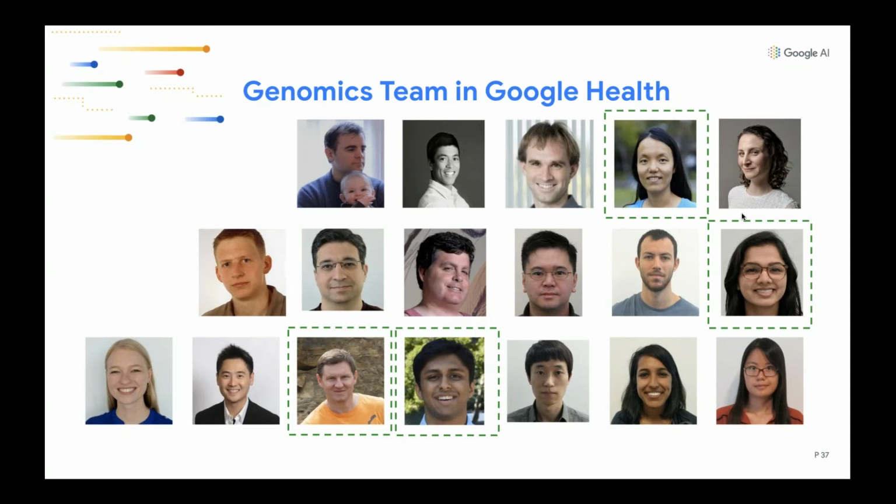That's actually what we did with the Drosophila data set, the rice data, and the HG2 human. For all three of those samples, we started with the exact same genomic DNA, and we just made HiFi libraries and CLR libraries from the same starting material. Generally, the top line summary is base QV is higher for HiFi. The contiguity differs depending on the organism. With rice, the contiguity is higher for CLR, but with Drosophila and human, the contiguity was higher for the HiFi. So we did that in the experiment. I talked about it in the talk.